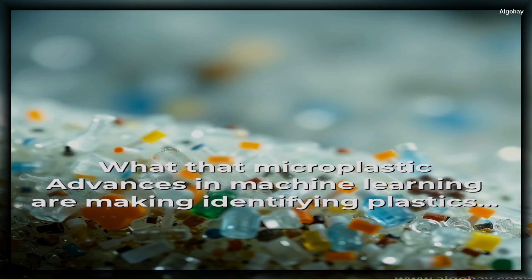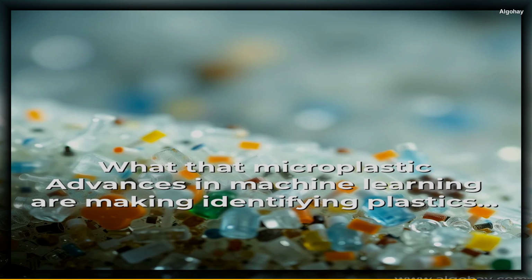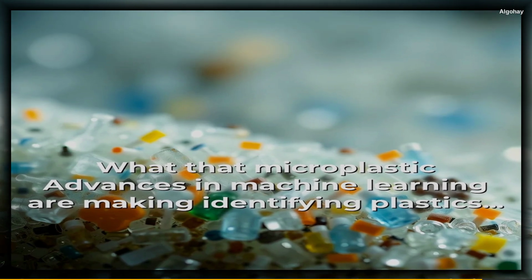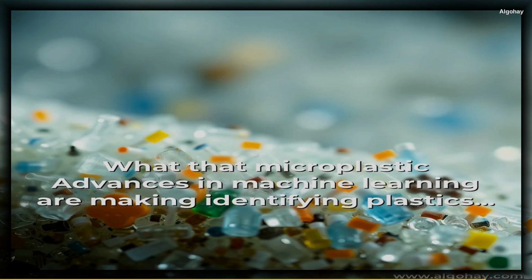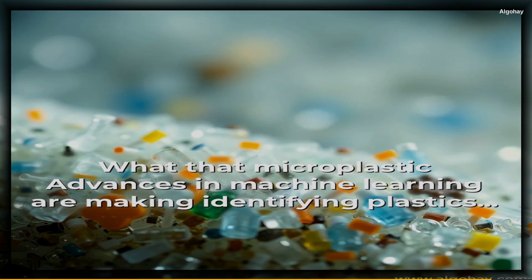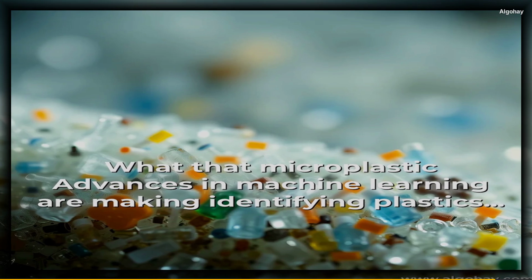Methodology. To develop the algorithm, we collected samples from a parking lot in Brighton, Michigan, which provided a diverse range of polymers. We obtained the spectra of these samples using various spectroscopic techniques, including infrared, IR, and nuclear magnetic resonance, NMR, spectroscopy. The spectra were then run through the algorithm, which used machine learning techniques to identify patterns and relationships between the spectral data and polymer identities.